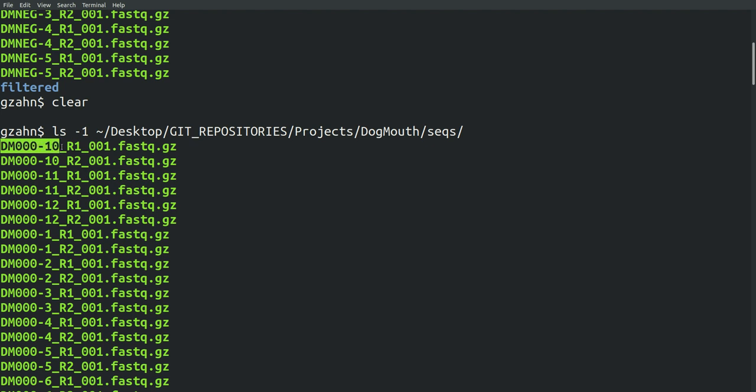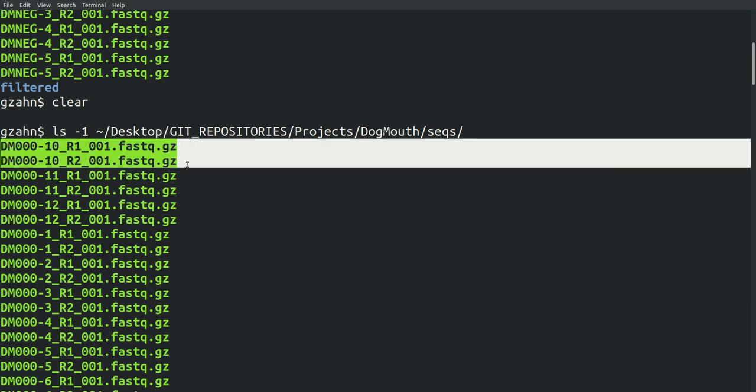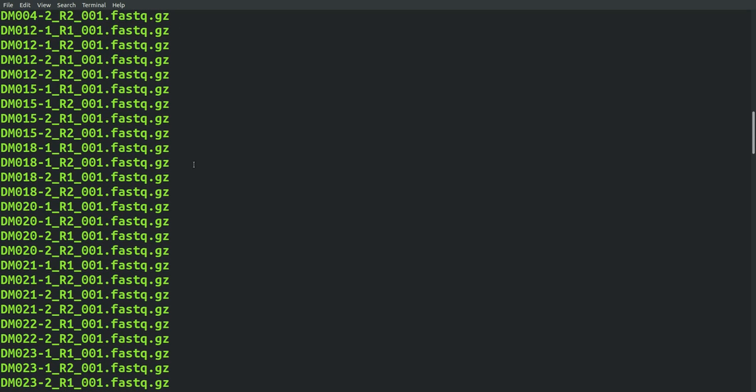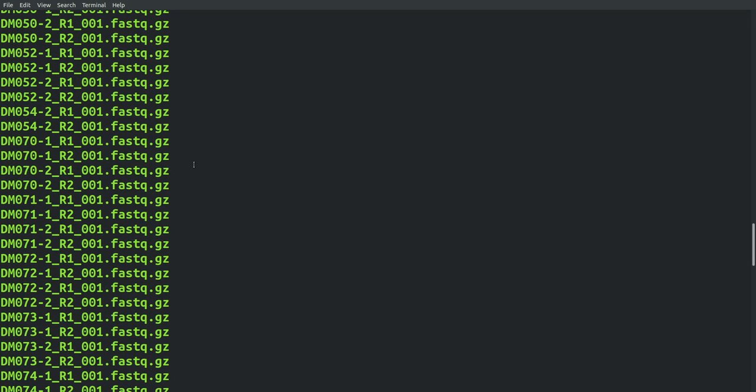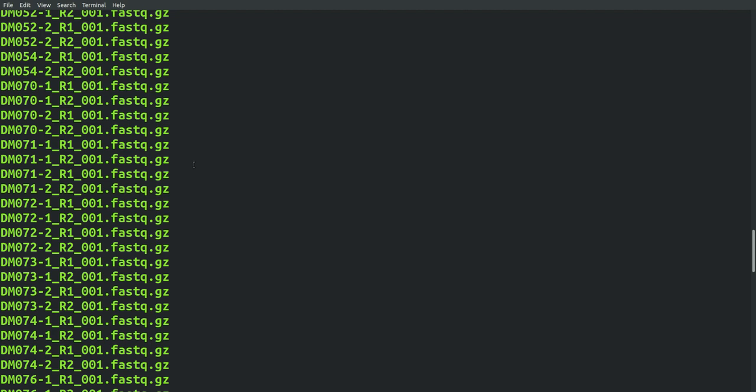DM000-10, that'd be the sample name. The R1 is referring to read 1, R2 is read 2. So those two files there are the forward and reverse, the first and the second read for that particular sample. Each sample has two reads, typically. And you'll see that this whole study had a bunch of different samples in it.